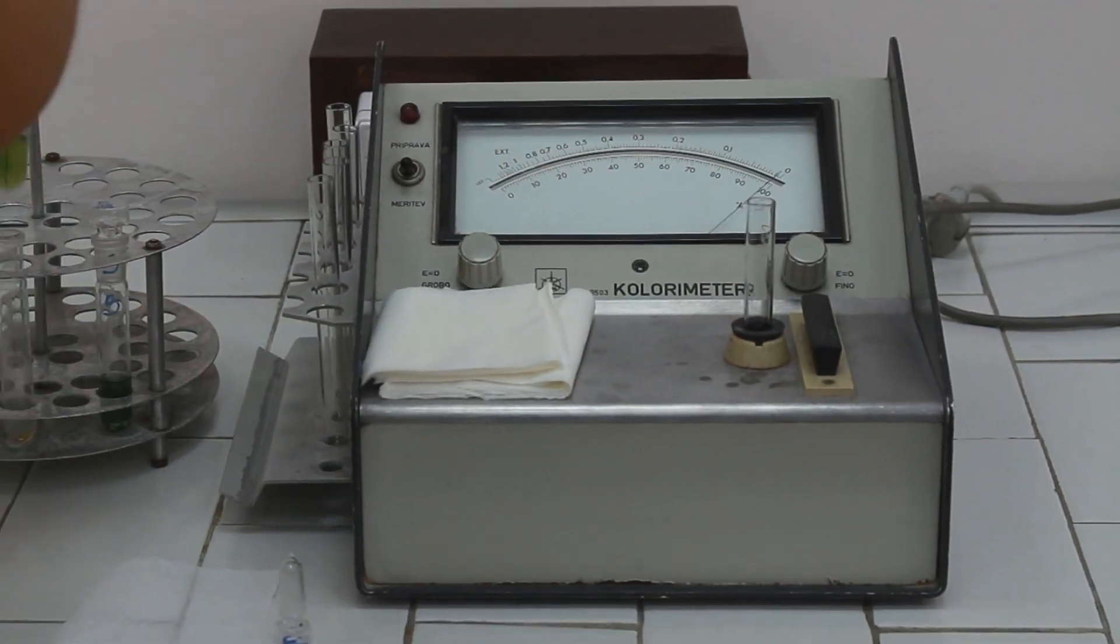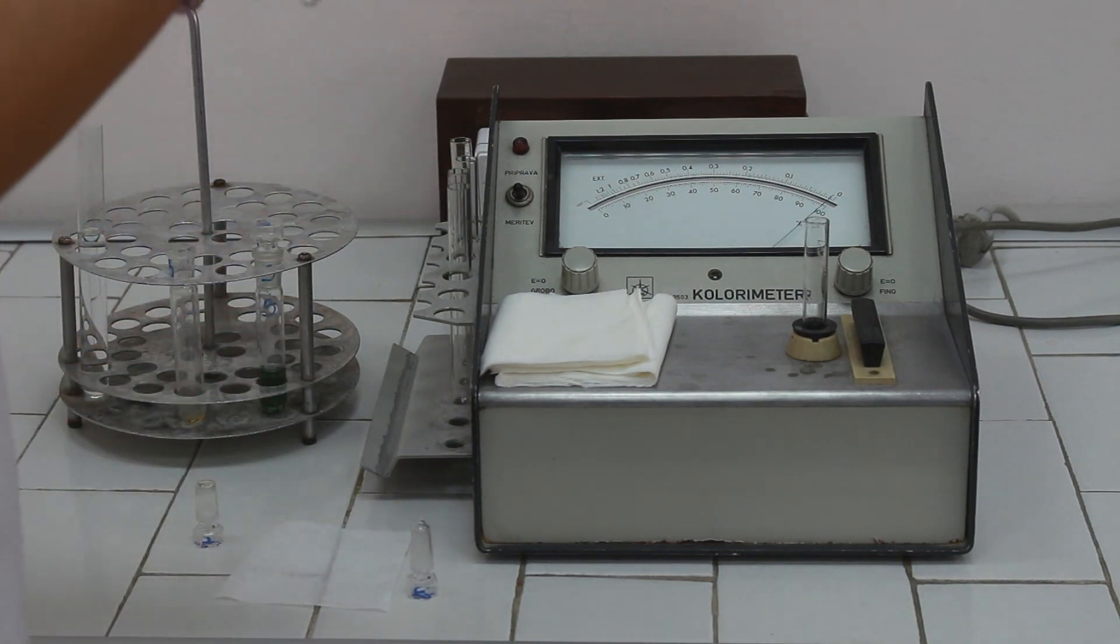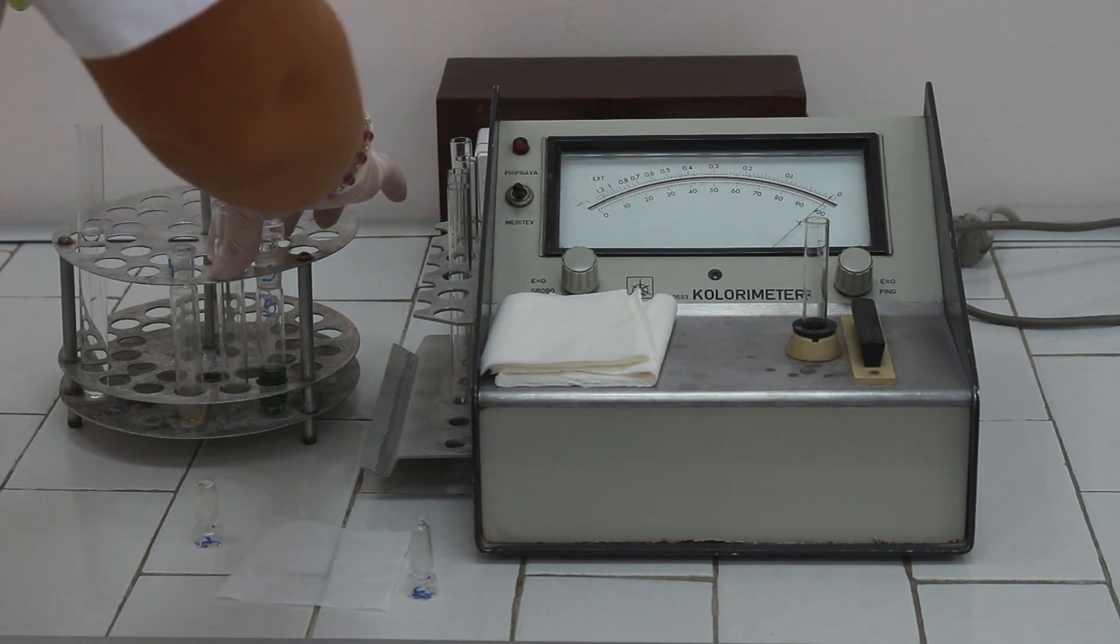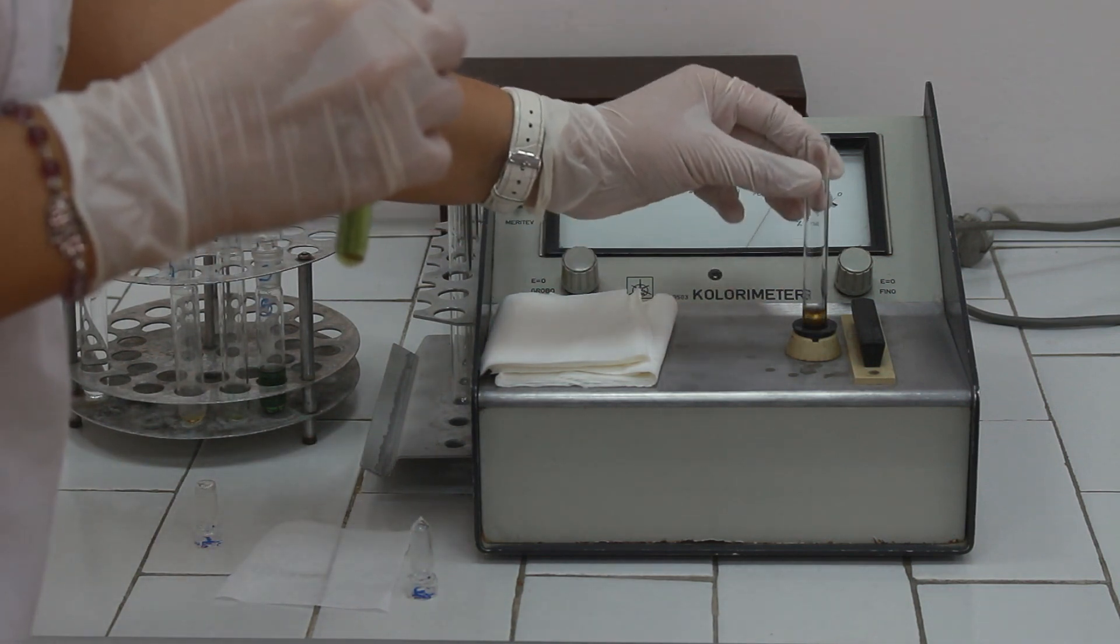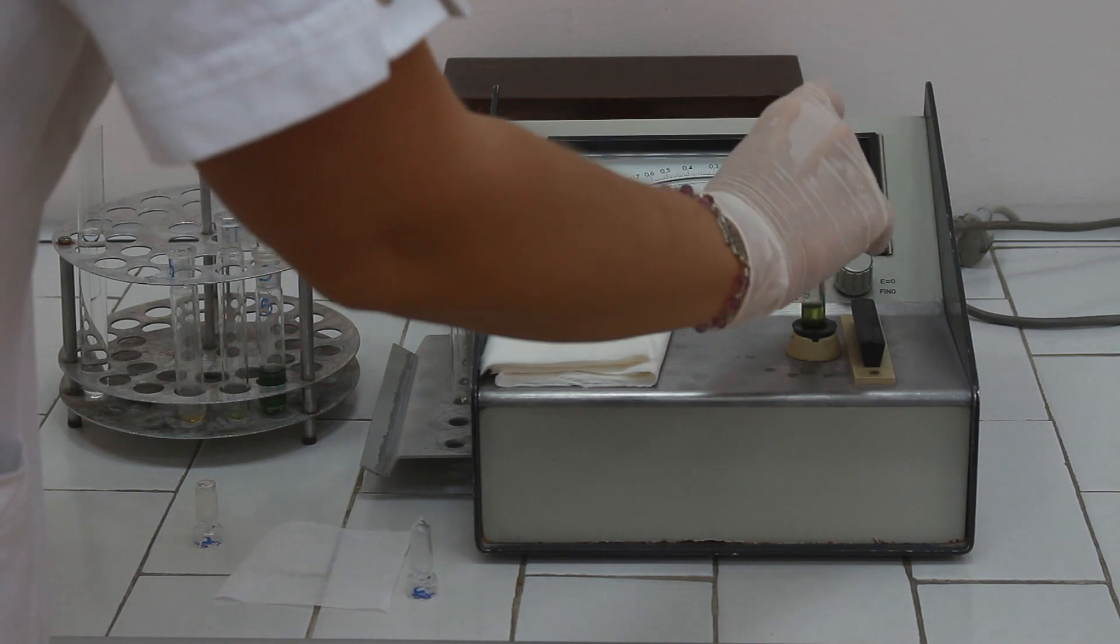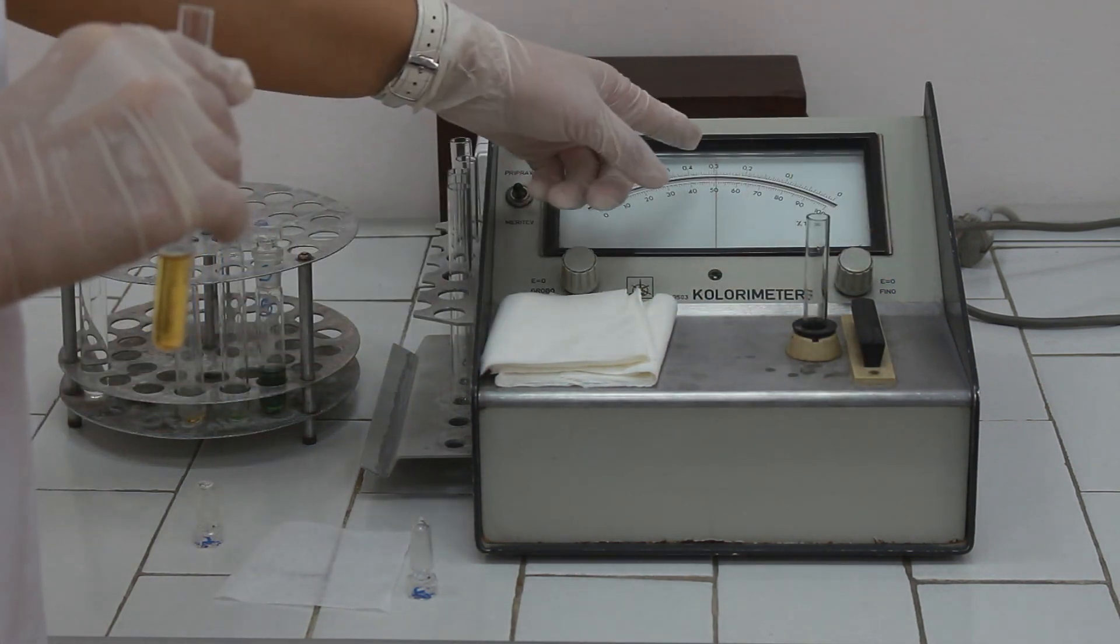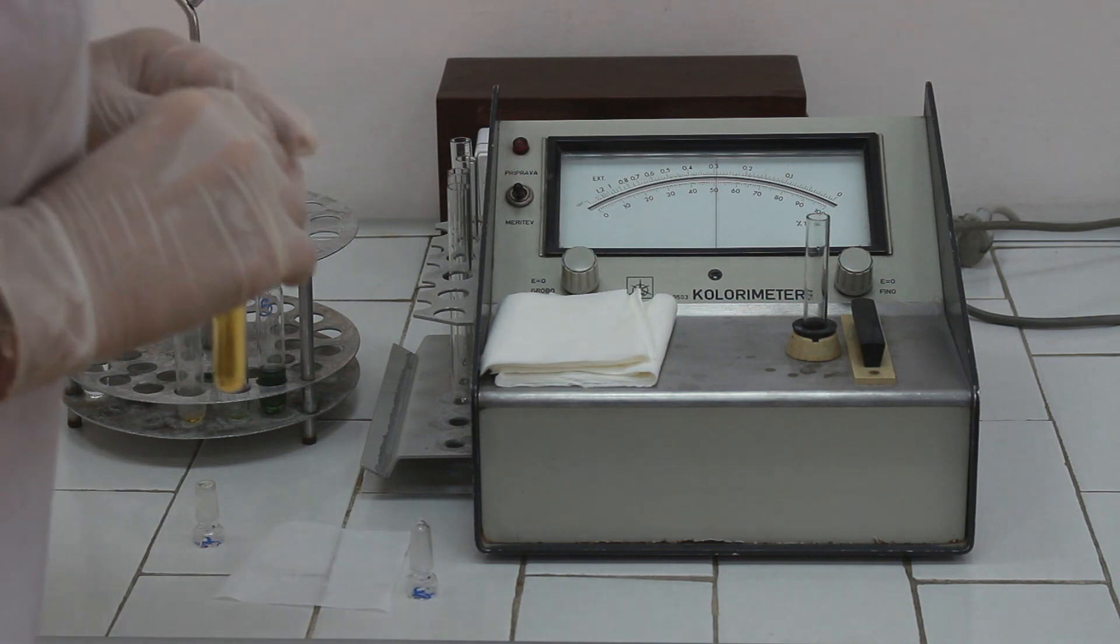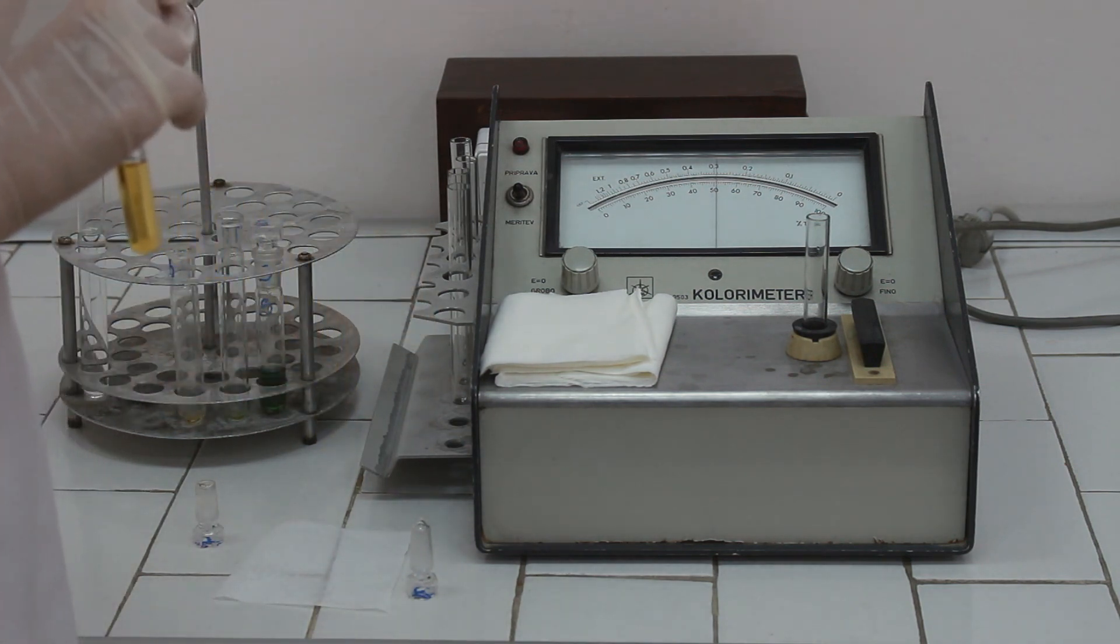When the zero is adjusted, we can pour the test solution to another cuvette. Take out the blank cuvette and put the test cuvette. Read the absorbance. In this case, the absorbance is 0.29.